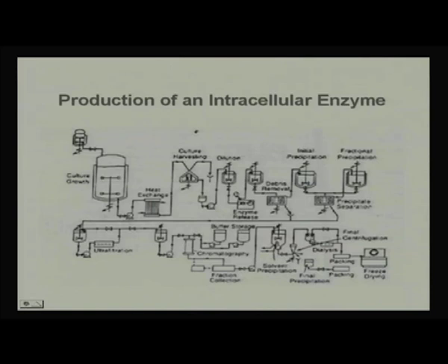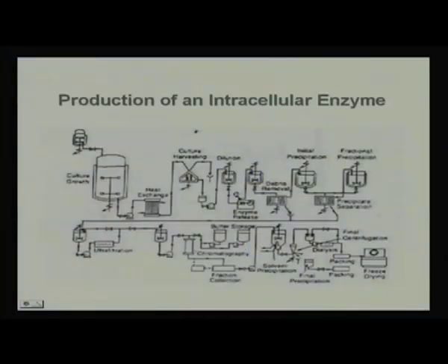We go for dialysis to remove the excess unwanted solvent, then freeze drying, and finally packaging of that particular intracellular enzyme.